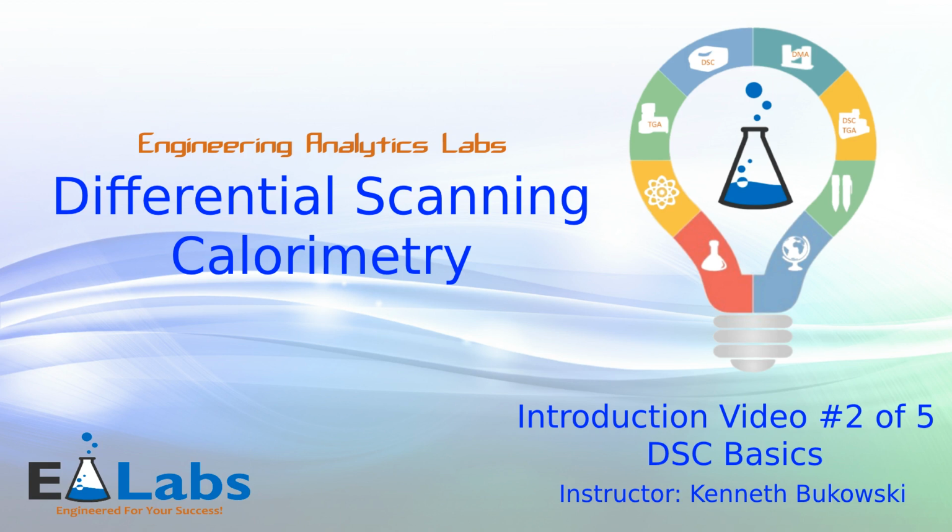The workhorse of thermal property analysis is the Differential Scanning Calorimeter, or DSC. This introduction course will review the foundational basics of a DSC, show how a DSC operates, provide DSC applications, and outline a few best practices for properly using and maintaining a DSC.